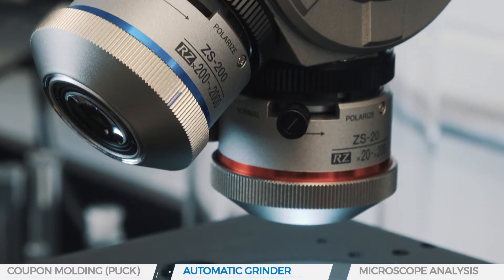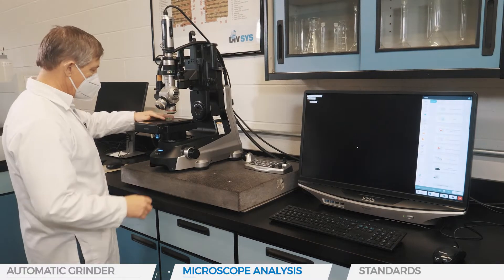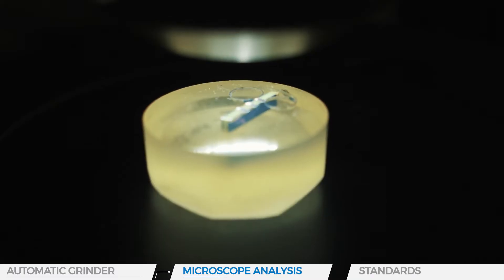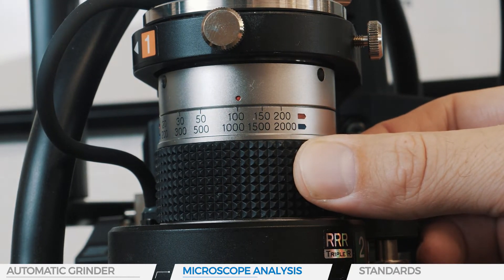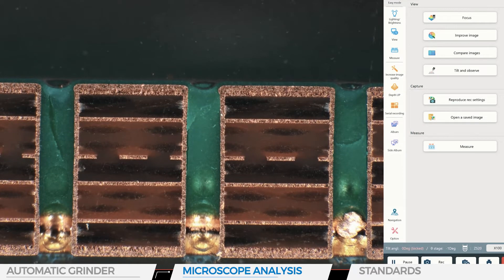Using the Keyence microscope, we put the polished pucks under 20 to 200 times magnification. This microscopic analysis can measure the thickness of the copper and look for imperfections that may have occurred. On the cut that has passed the solder flux test, we will be able to analyze the solderability of the PCB.